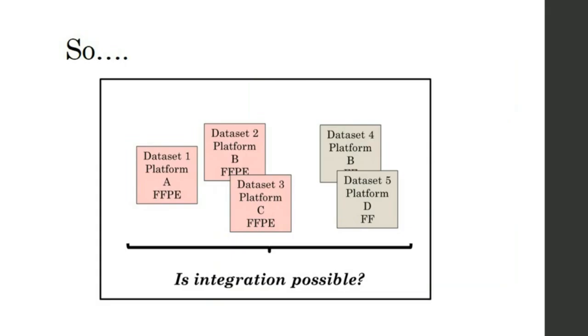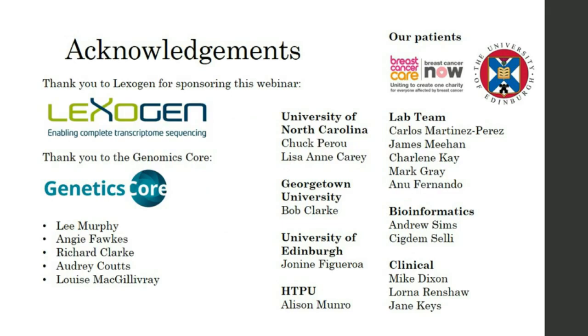And so if we go back to our original question, can we produce these kinds of data sets from FFPE tissue, and is integration possible? I think the answer is yes, with the caveats that I've mentioned. So I'd just like to thank you all very much for tuning in today, and I hope this has been of some value. Our paper with considerably more data is currently out for review, so hopefully that'll be out shortly. And the data sets have now been uploaded to NCBI GEO if you want to perform your own analysis and look at the data that we've generated.